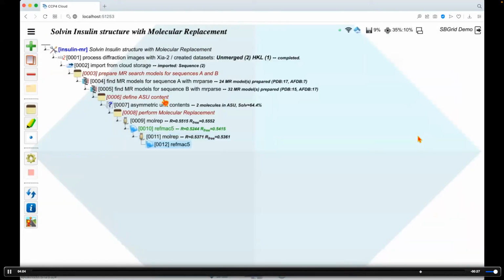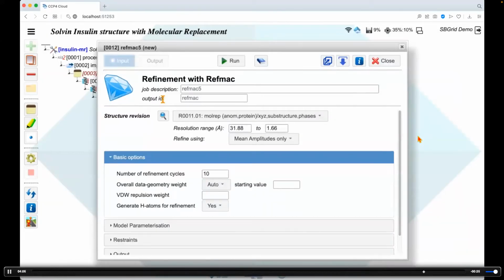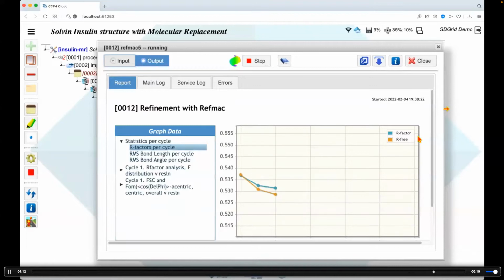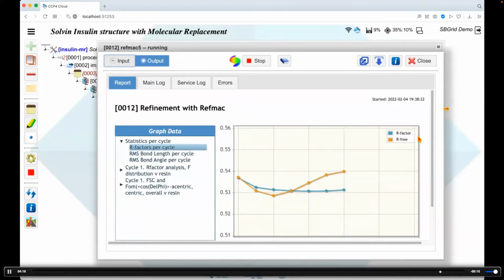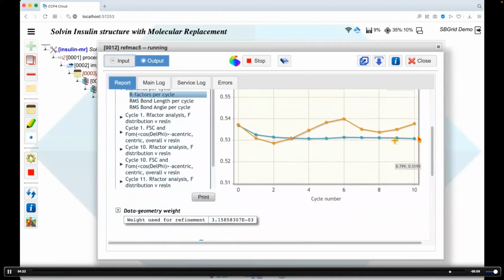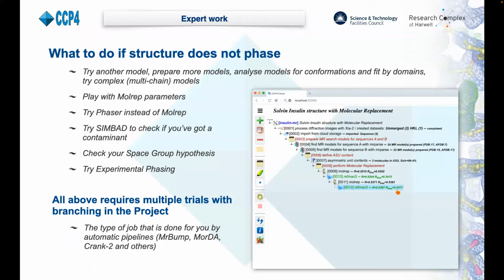that it is a profound failure, although this is obvious even at this stage. And this is the proof. It doesn't refine, it doesn't go down, so we have to forget about this. Now the question is, what do we do next?